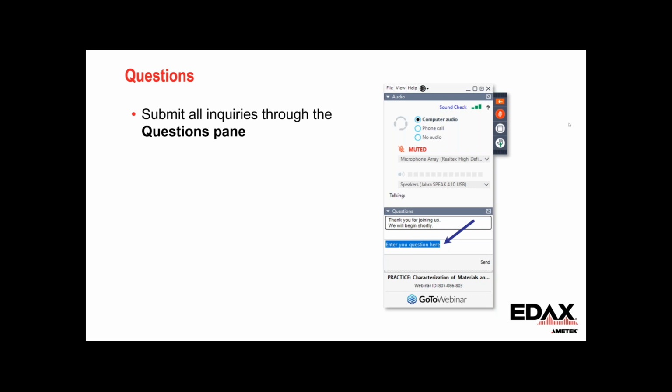Where that may not be true is something like a fine lamella grain with a large enough step size that you're only getting a point or so along the width of a narrow grain. We've seen examples where that grain is lost with NPAR, and that would change the grain boundary texture. Generally, I don't think it will change it significantly, but it would depend on the density of that. But certainly, in that case, you really need to be using a finer step size anyway. That's what I was going to say too.